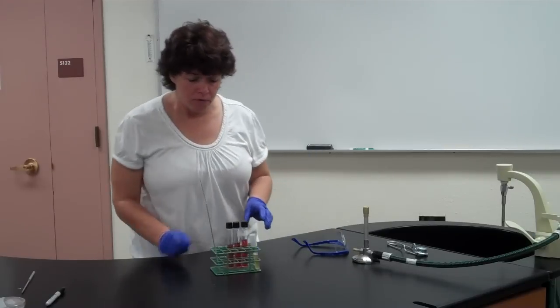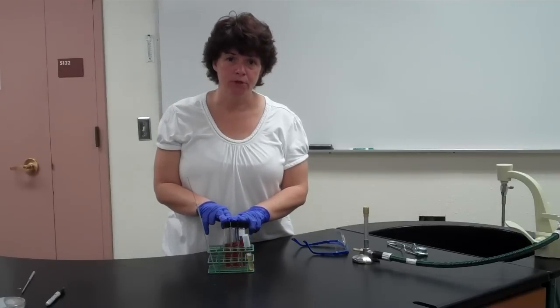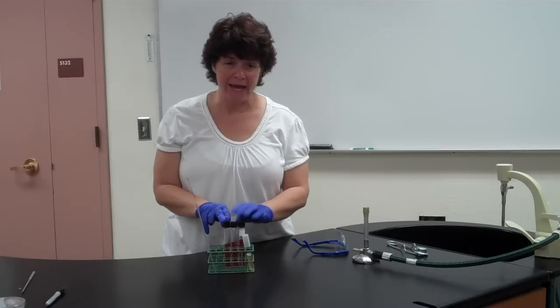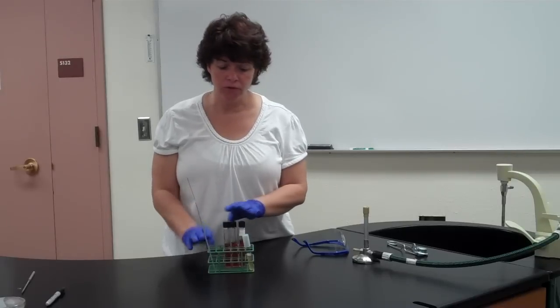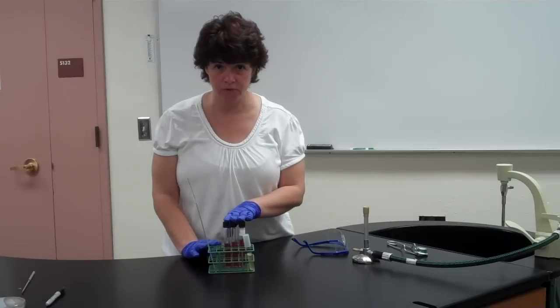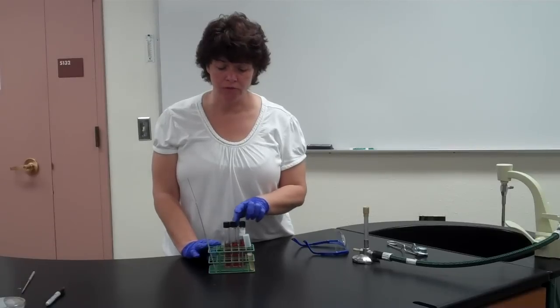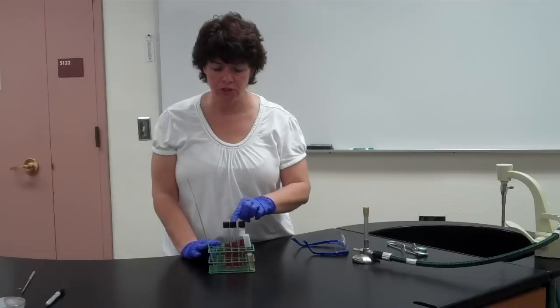Okay? With this one, you're going to have 3 of these per bacteria. We have 3 of the bacteria and possibly we'll have 4. So you'll either have 12 tubes or 9 tubes. Okay, so if we have 3 bacteria, you'll have 9. If we have 4 bacteria, you'll have 12. These are 3 different sugars. And so you're going to put each bacteria into each tube.